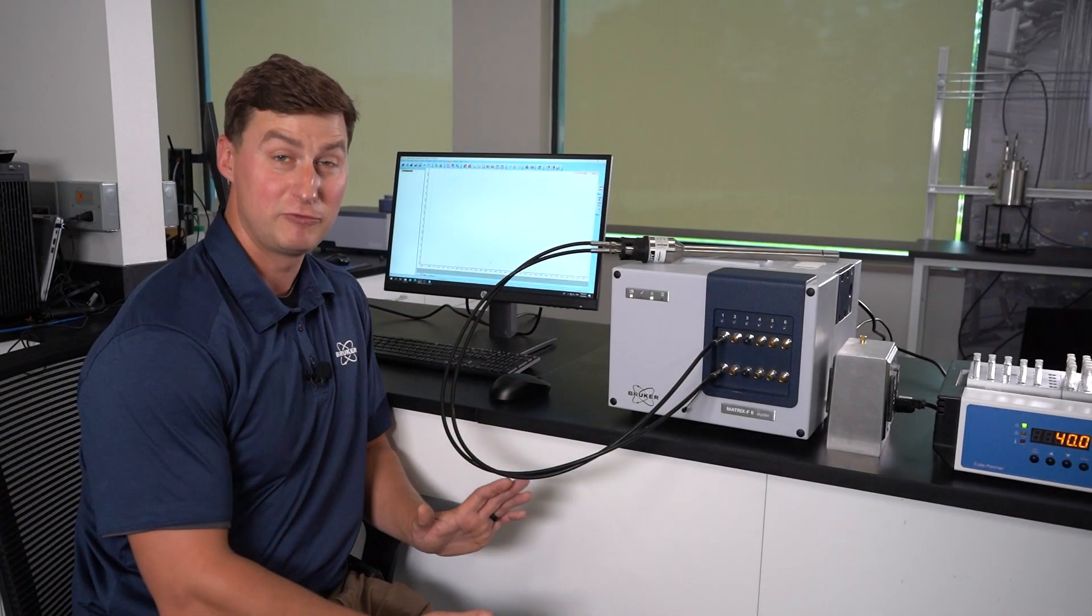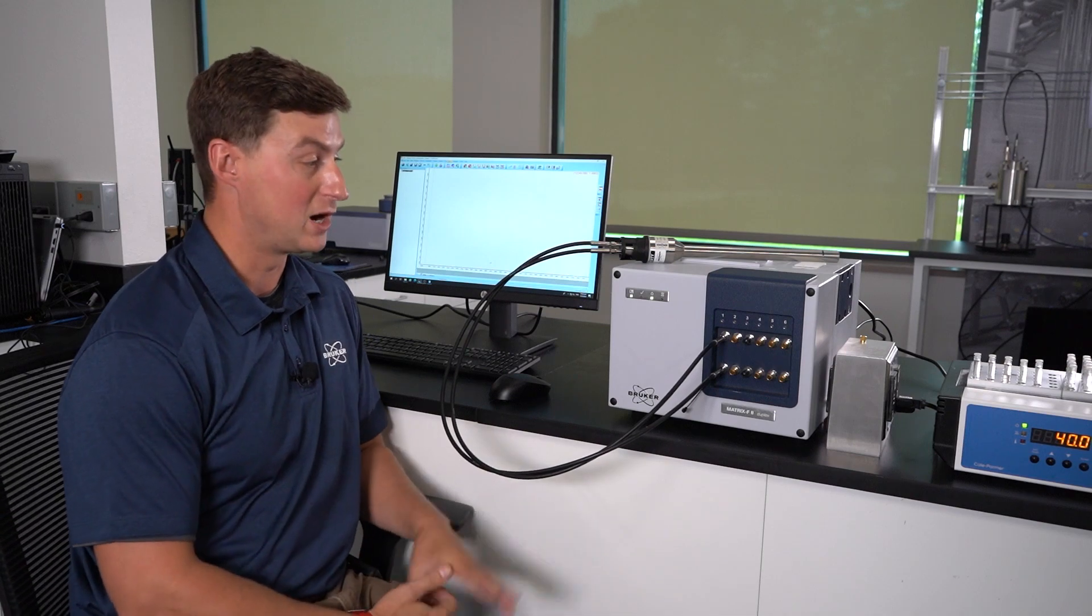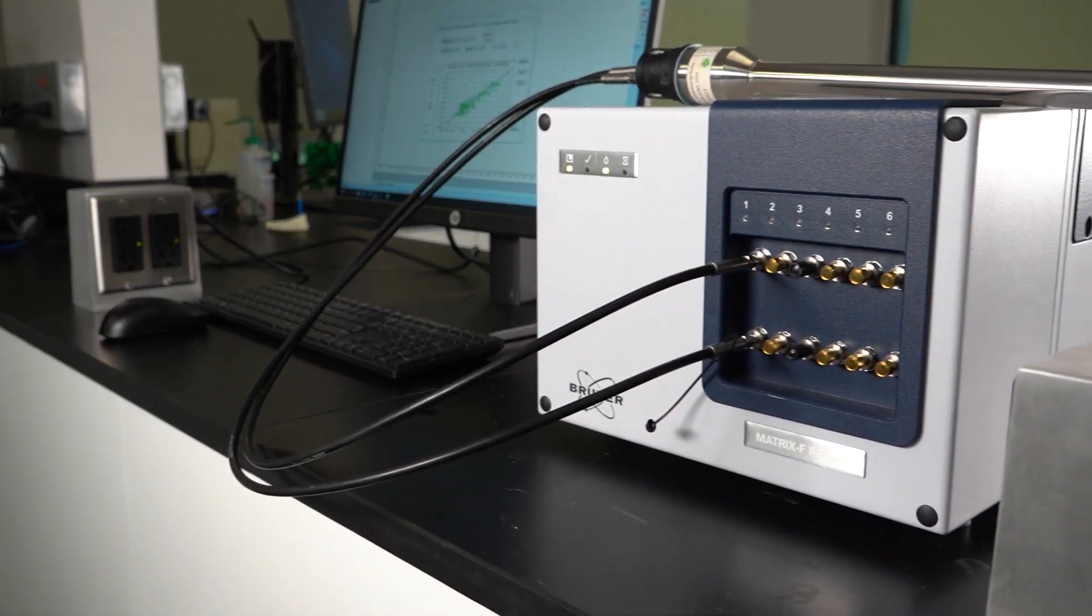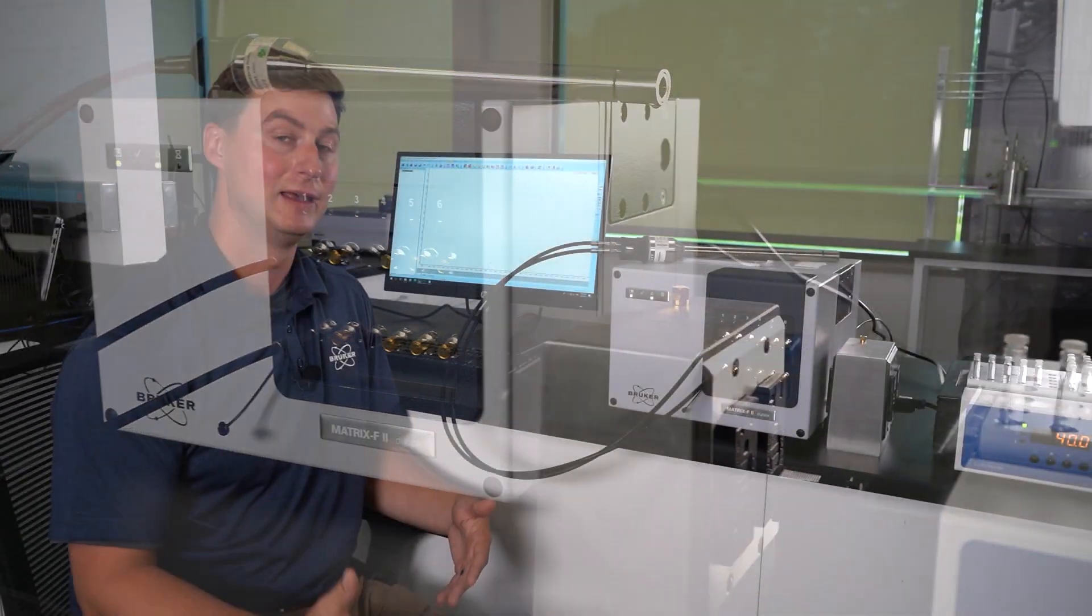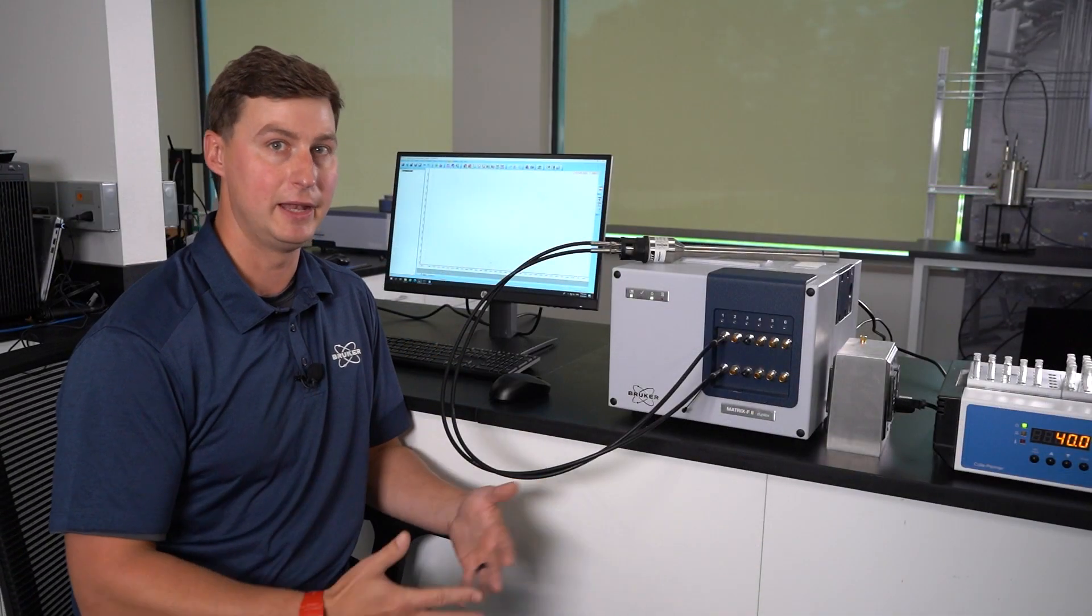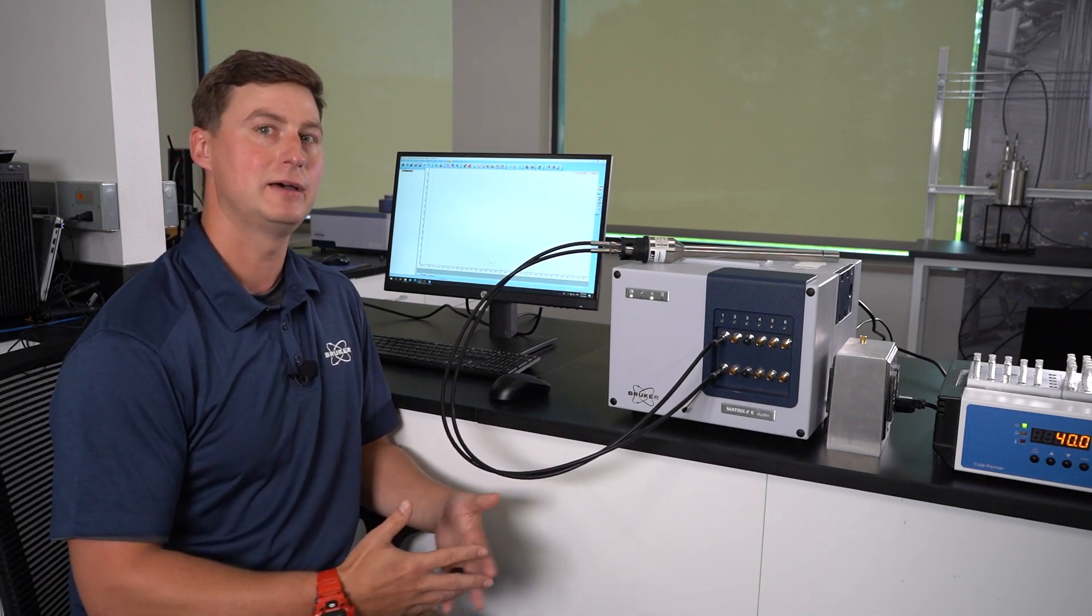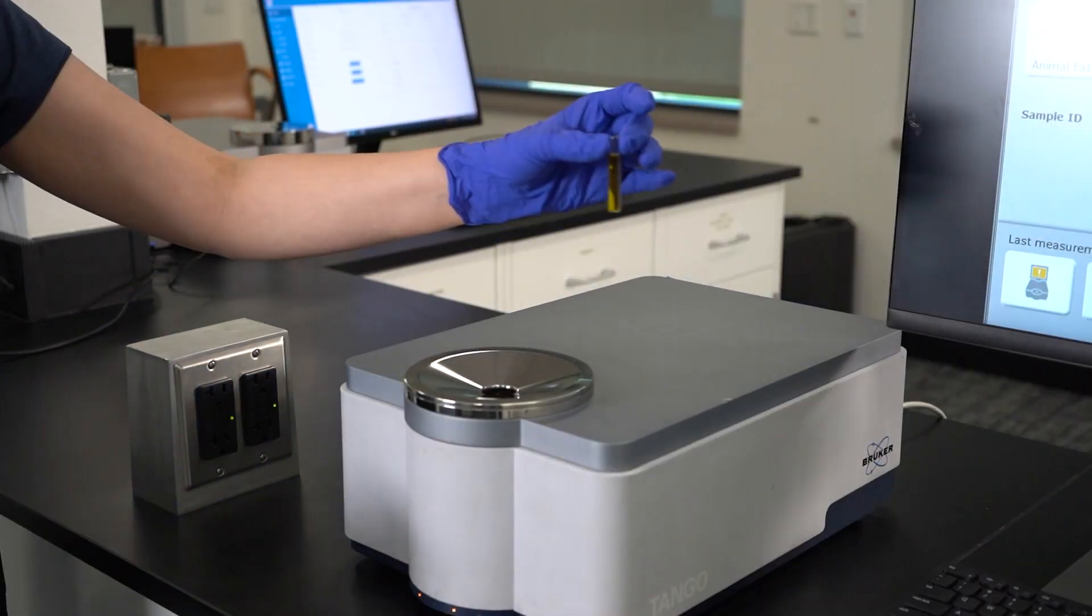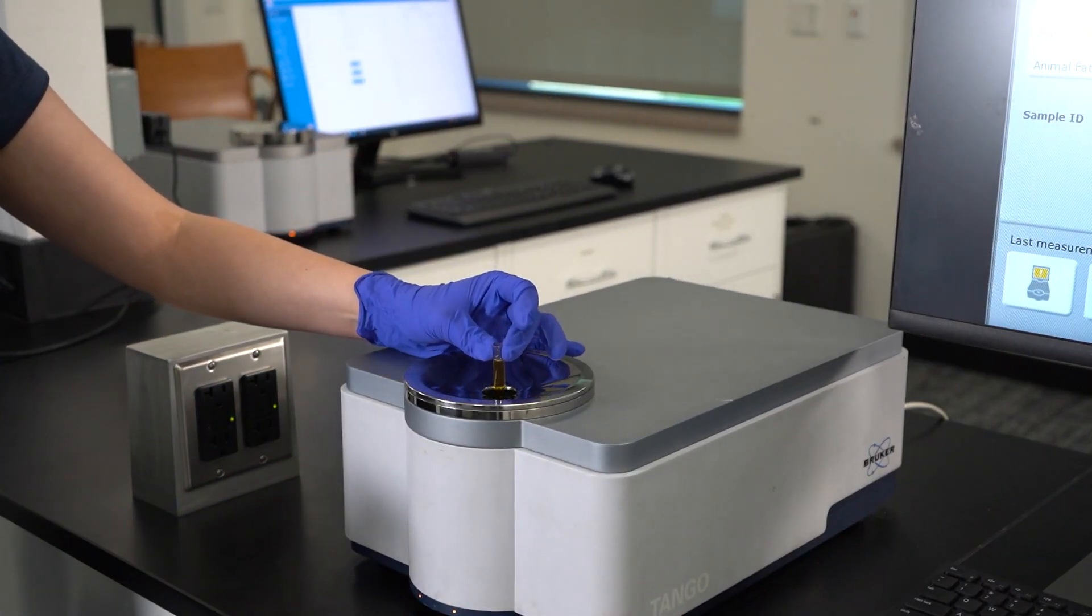A question we frequently get from customers inquiring about building or using our process analyzers for inline analysis and real-time analysis is where to start with building those inline analysis calibrations. There's a couple different ways to do that, but we often suggest they start with a benchtop calibration and then transfer that over for use on the process system.